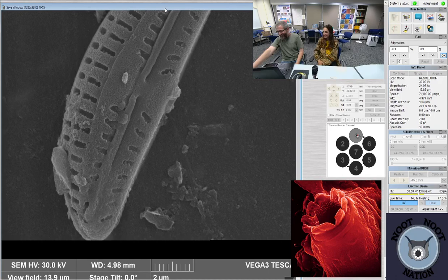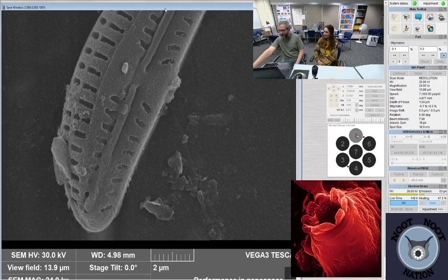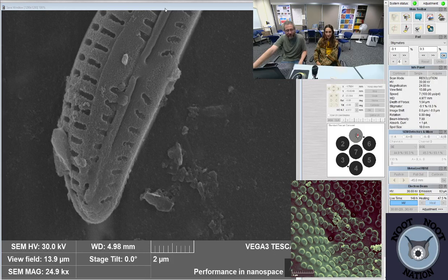Can this SEM do X-ray spectrums to determine chemical analysis? It does, Patine. It's the X-ray EDAX elemental analyzer that I showed earlier, if you were here when I was doing a little tour. This one's an amphora? Or what is this? Yes, one? Amphora ovalis.